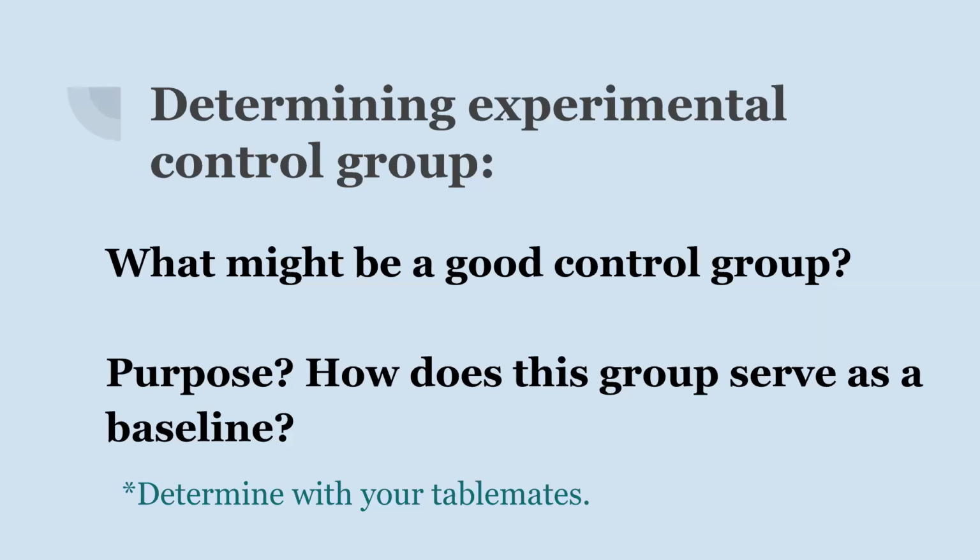So would a good control group be, say, is our not-water sample the control group, or is that the negative control? That's the negative control, right? Because it's soliciting no or minimal response. Okay? Because we're getting no banding. We should get no banding unless there's contamination within the negative control.